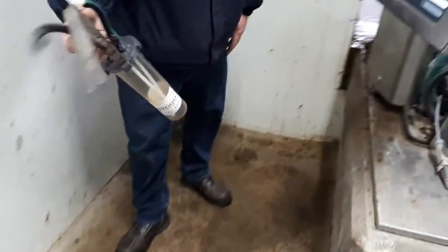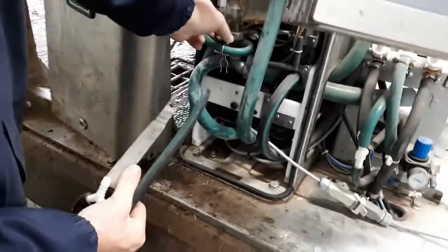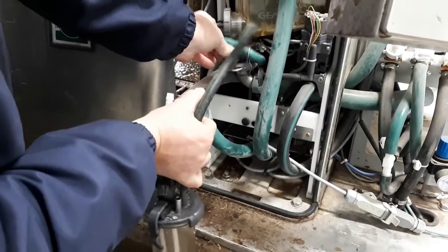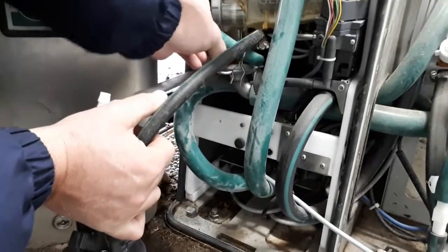Next, what we've got to do is add the reservoir in. So we have to undo this screw here, open it up so the reservoir slides in, then tighten it so it doesn't go anywhere.